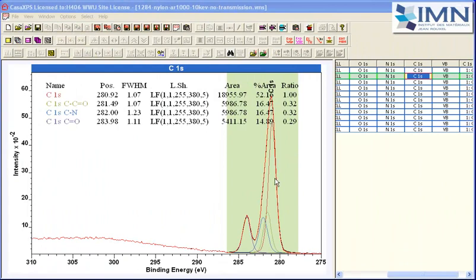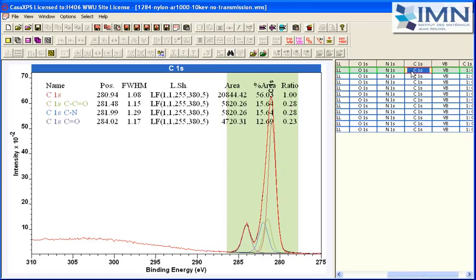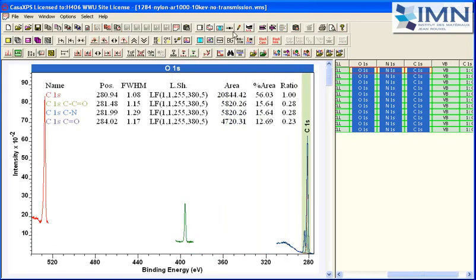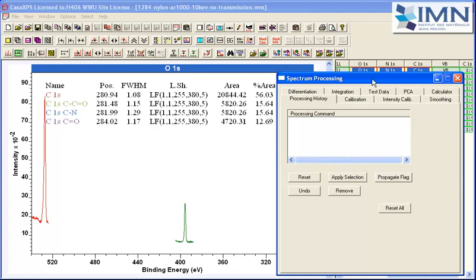When this peak model was constructed, there was a preconceived idea that we had nylon. So the peaks that were introduced, the number of peaks and the ratio of these peaks have been entered into a peak model so that we are testing the data against the possibility of seeing nylon. And we can see that in the first instance, the as received data wasn't quite nylon, so the model is perhaps imperfect. So rather than having a preconceived model, let's go with a new approach that relies on extracting the information from the data rather than imposing what we think it might be.